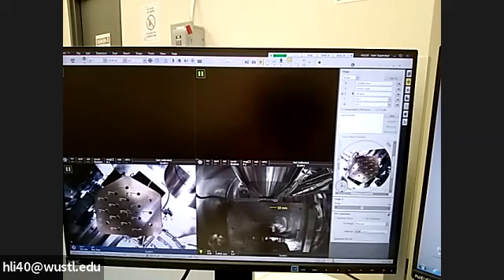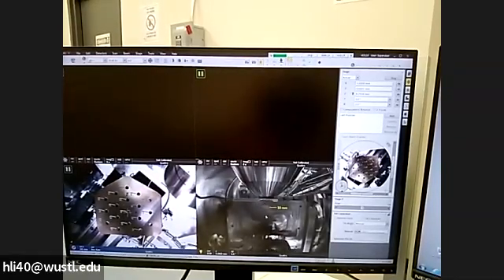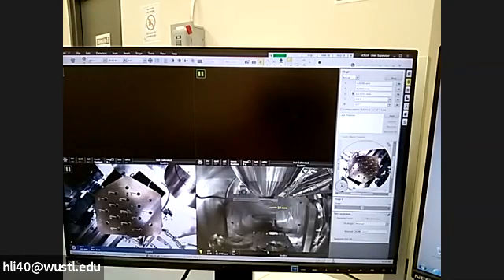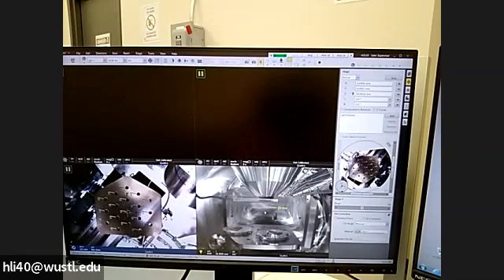If you are not sure, you can move to a smaller number to see how much it progressed. But don't take it for granted that this is 10 millimeter, this can be maybe 70. It's not proportional, because the camera is not mounted straight. I mean, it's a camera, it has an angle there.